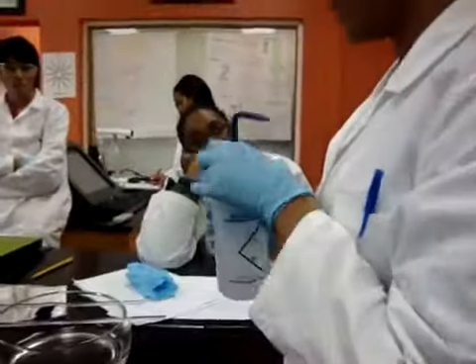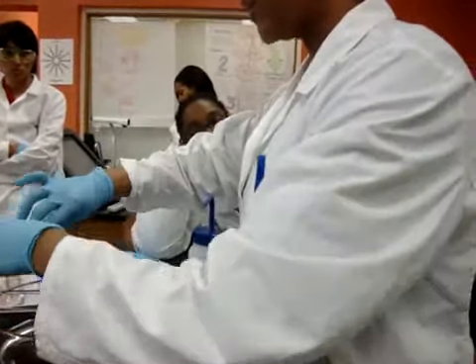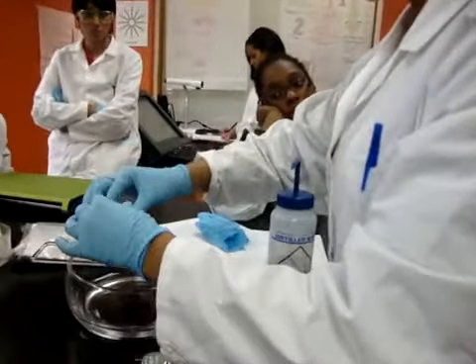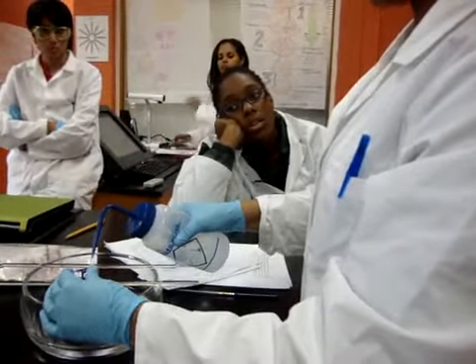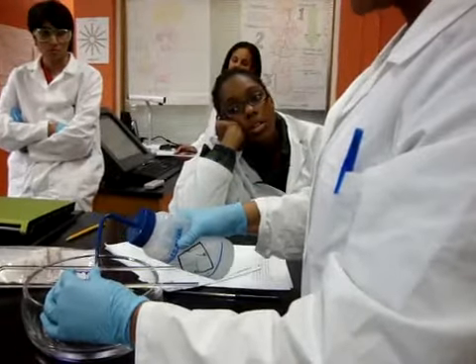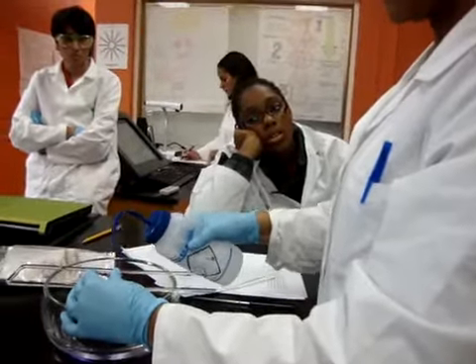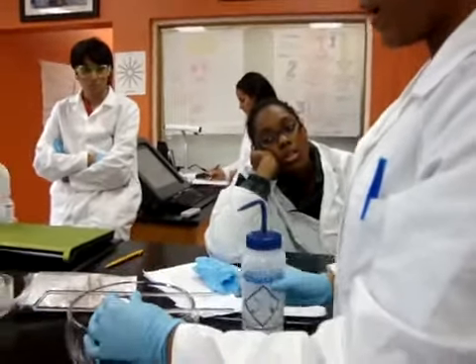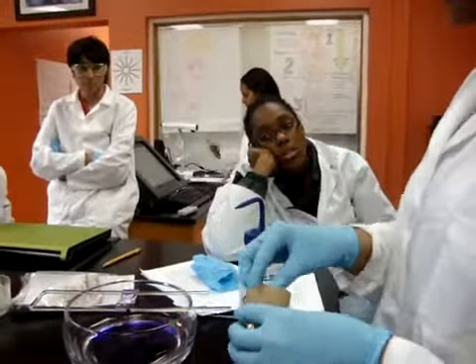This is going to take up time, but anyway. If it had been a minute, I would wash this off. Now when you wash it, what you don't want to do is squirt it right into the circle, because you might wash your smear off. Gently let the water run around your circle. So squirt it somewhere else on the slide so that the water just rolls over your smear. And then put it back on here. Go to your next one, which will be the iodine.